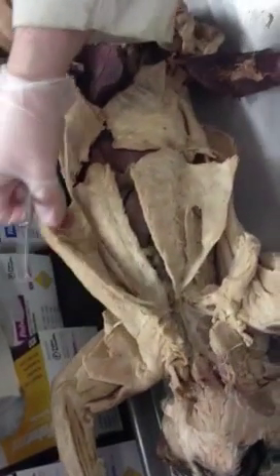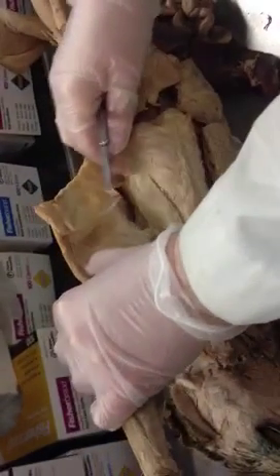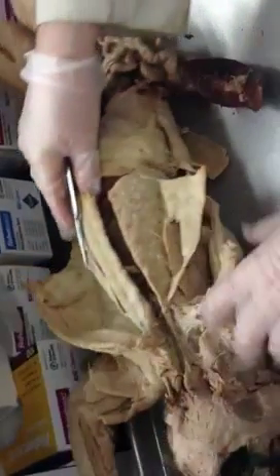And then I think we did the deep pectoral muscles next, if I remember correctly. Let me see if this side is better.